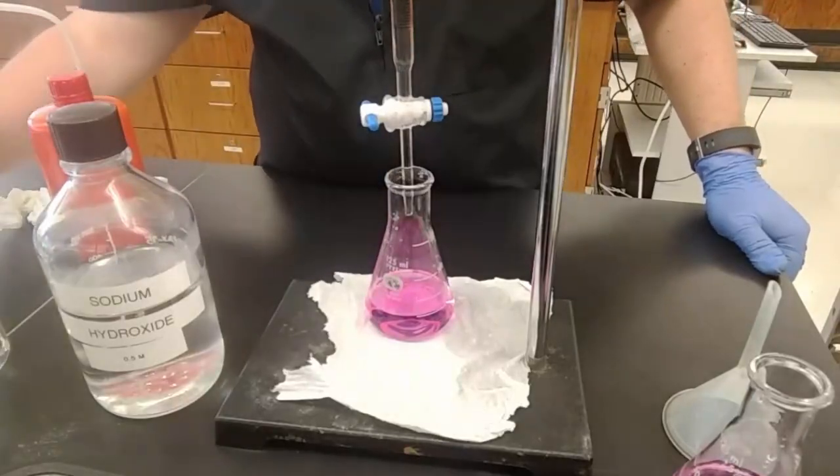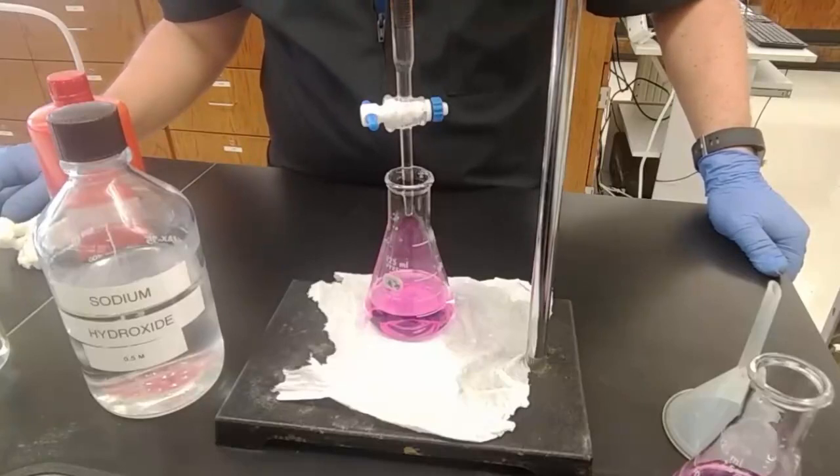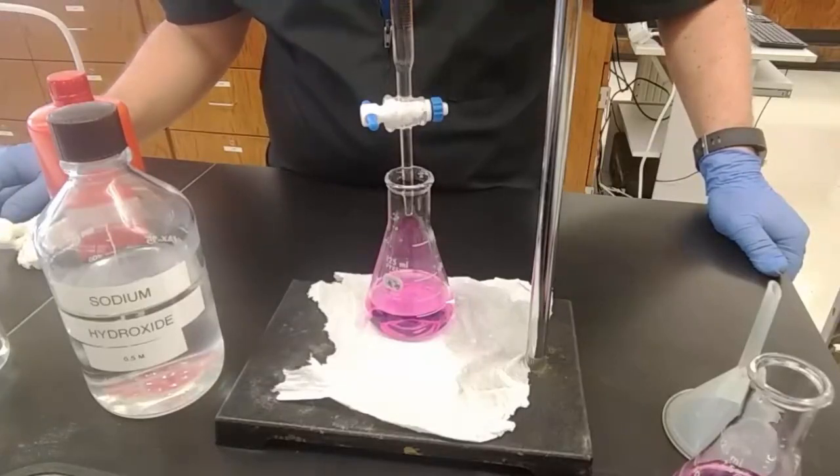And do your calculations, and that is that. You have successfully figured out the percent by mass to volume of acetic acid in vinegar once you finish your calculations.